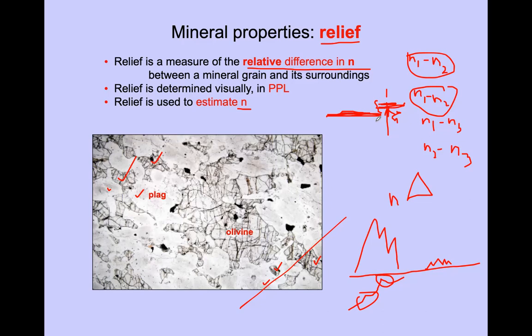For example, if you observe olivine in Sri Lanka, and another person observing olivine in America should see the same color after the second polarizer is inserted. Otherwise, we can't have a common consensus on having this particular color, right? Both of us should see the same. Otherwise, we can't say that this is olivine. So that's why all these standards are there, right?